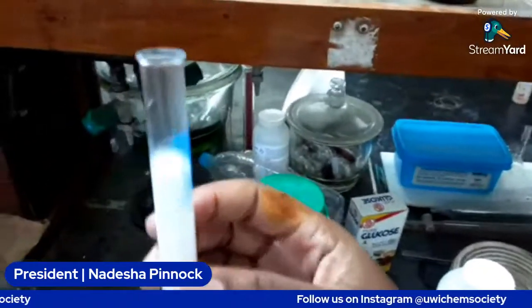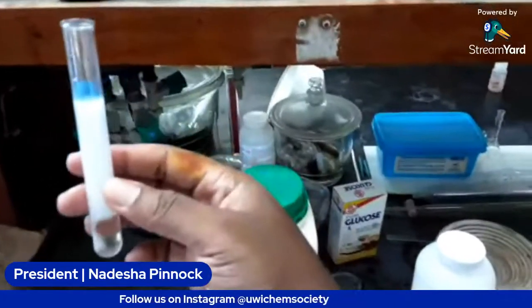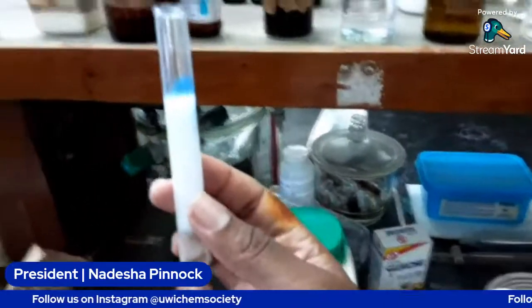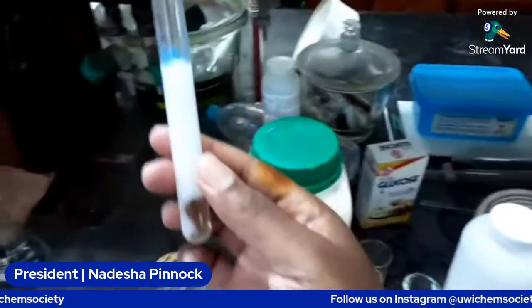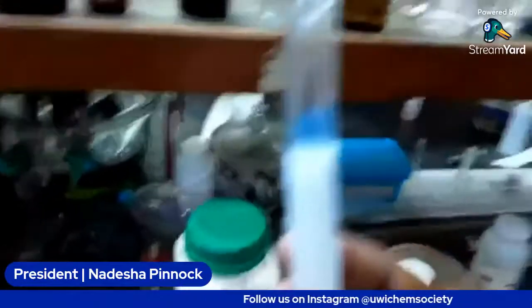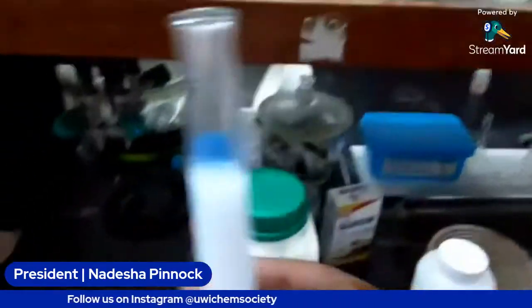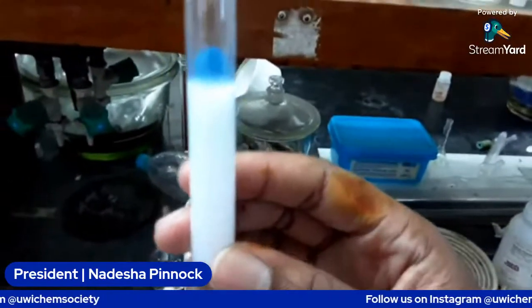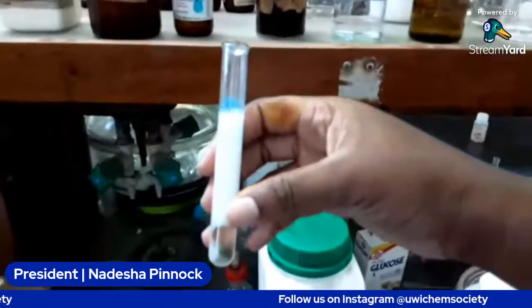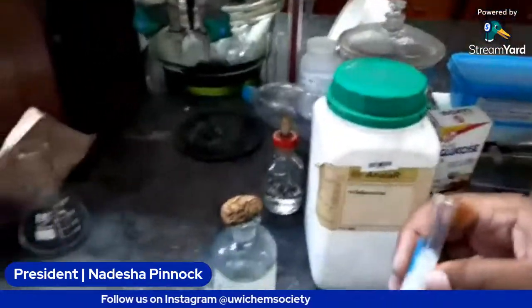And then when you add the water to that, this is what you call a colloidal suspension, an emulsion. So it pretty much looks like watery milk, like a true water from milk, basically. So that's the result for the emulsion test.